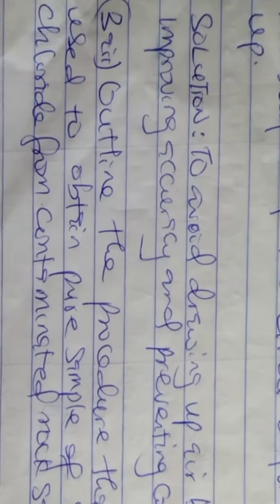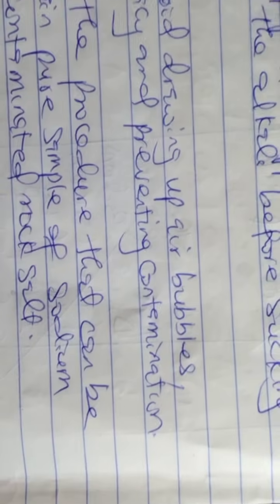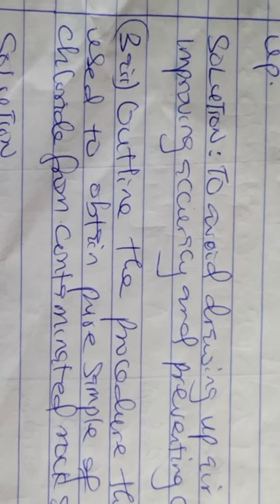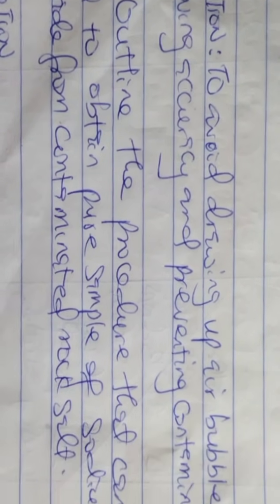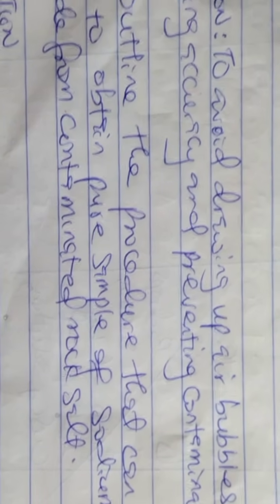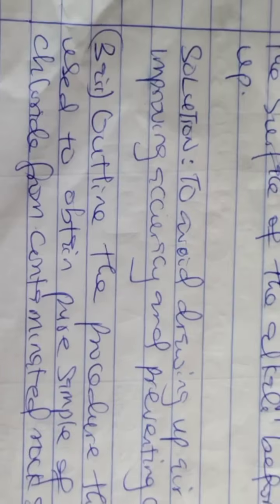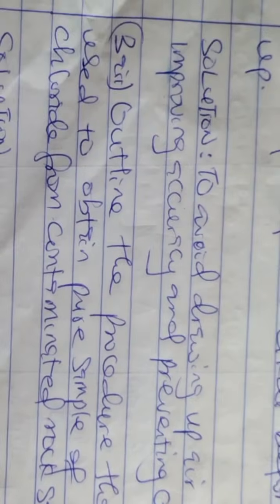Number 3AII says, outline the procedure that can be used to obtain pure samples of sodium chloride from contaminated rock salt.